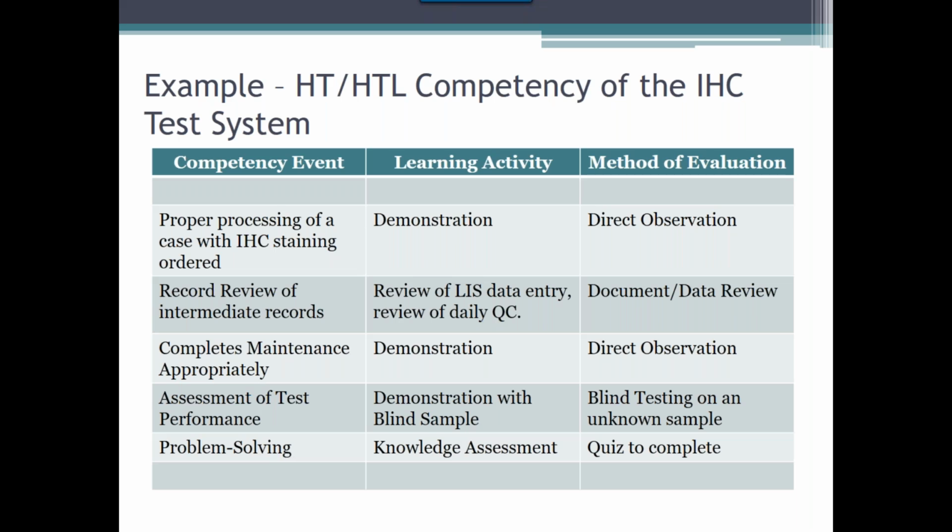And then the last piece here is, again, that problem solving. So we will assign them a quiz to complete, and then we will grade that quiz and give them feedback on that quiz and decide if there are things that we need to do further as far as either re-education or give them other resources that they might need to read if we feel like there's some areas where they may be weak on.